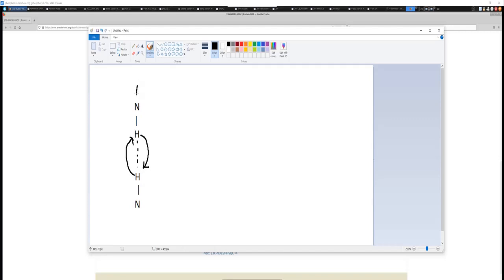Now let's say this is your I peak. This is the amide that you are looking at in your NHSQC. Now this I peak, let's draw a strip here. This hydrogen is going to have a specific chemical shift. The hydrogen that it's looking at is also going to have a unique hydrogen chemical shift. And so say that shows up over here, right?